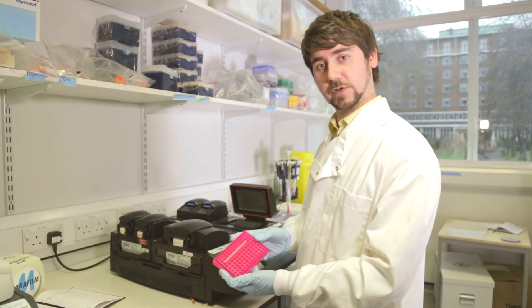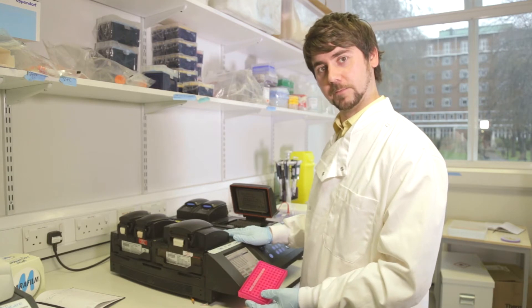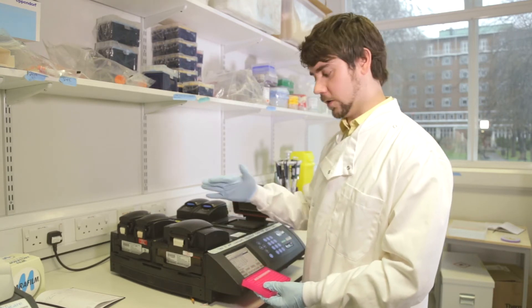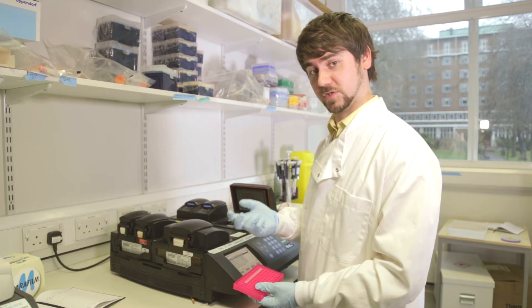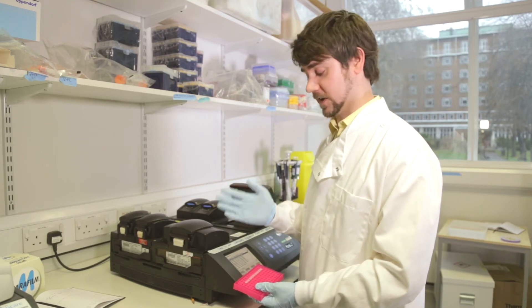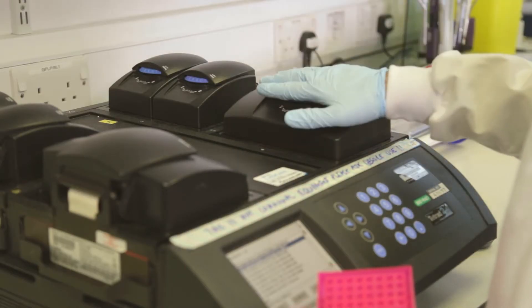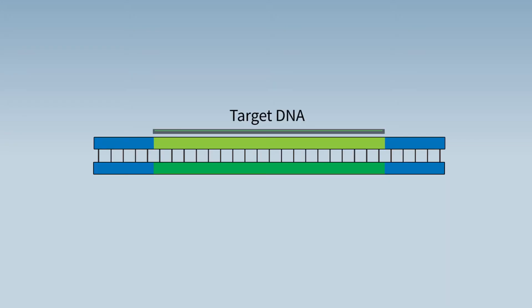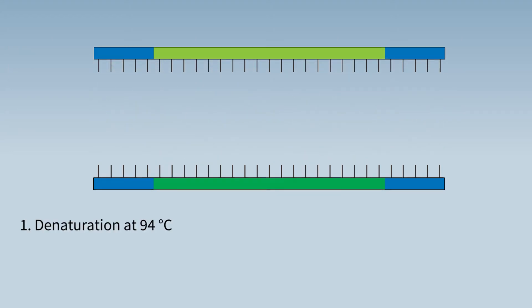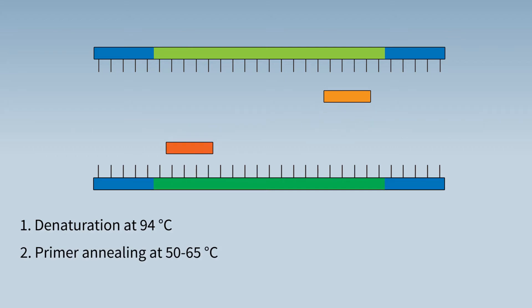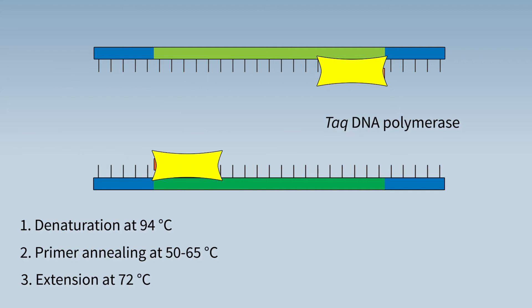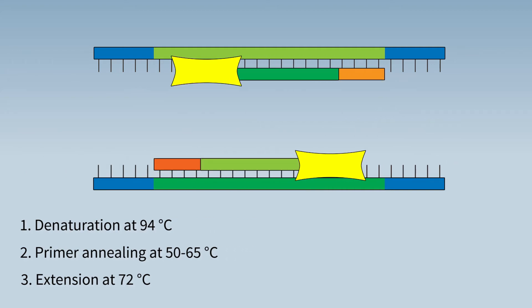Now we have our PCR reaction set up and ready to go, we can put it onto the thermocycler. An important thing to note is that while this machine thermally cycles and amplifies the DNA, the enzyme we've used — Taq, from Thermus aquaticus — is thermostable, so it will not be degraded by the thermocycling. The program runs through 30 cycles each with three stages: denaturation, where the DNA molecules are separated; annealing, where our primers bind to the region of interest; and extension, where Taq polymerase amplifies the DNA and incorporates the new dNTPs.